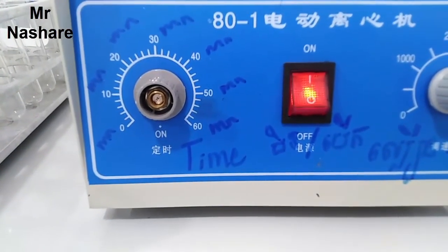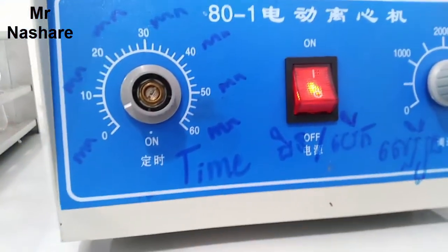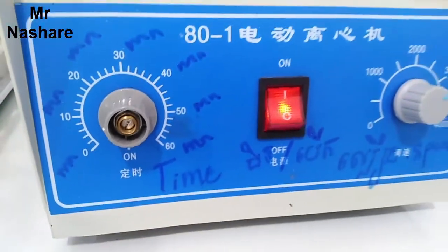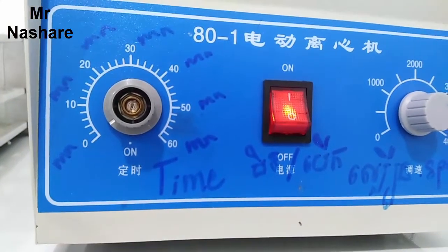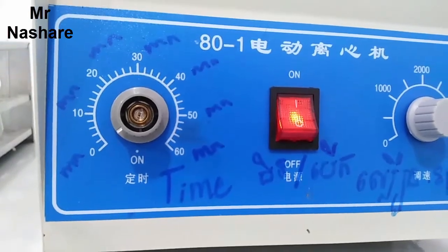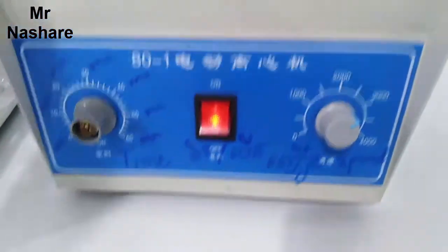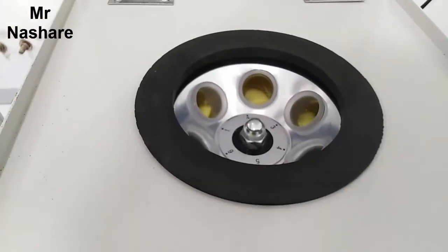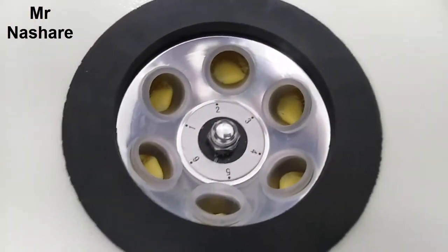It has about 5 minutes left. Now it is nearly finished. The machine will finish. Now we open it and push it.